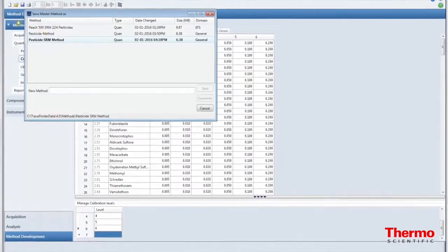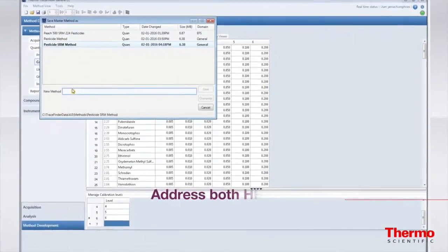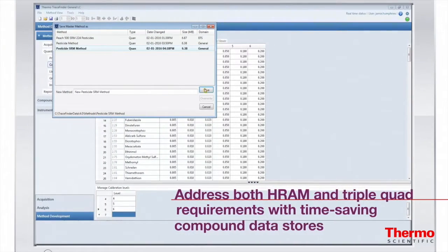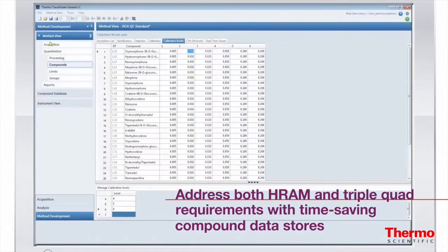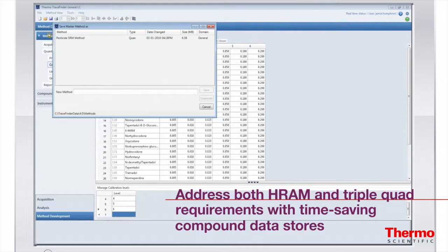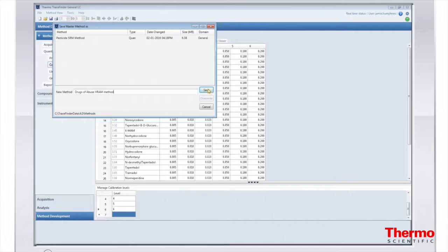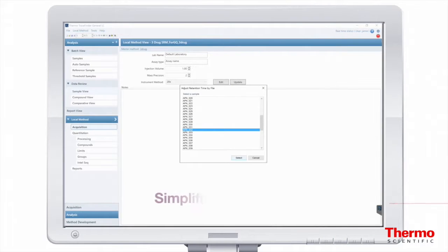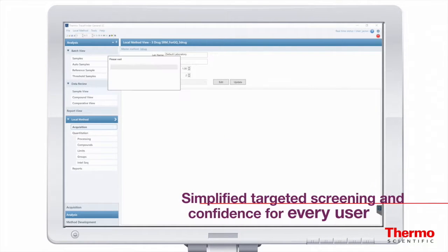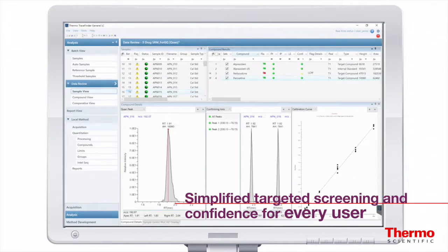Select compounds and develop methods rapidly with time-saving compound databases that include parameters for both SRM and HRAM. MS/MS targeted screening is simplified and streamlined with automatic retention time adjustment.